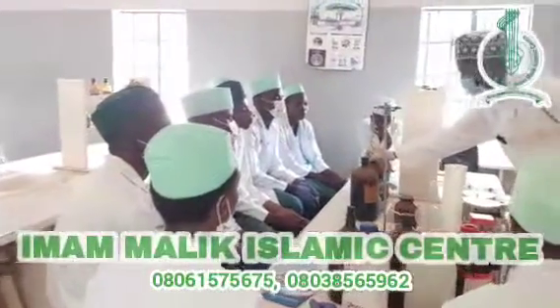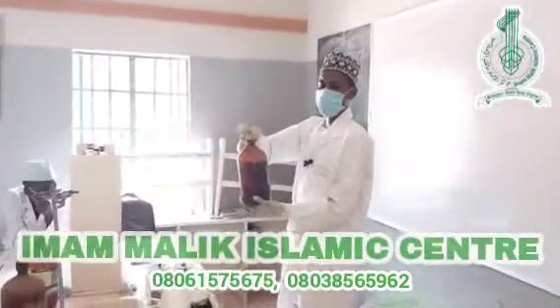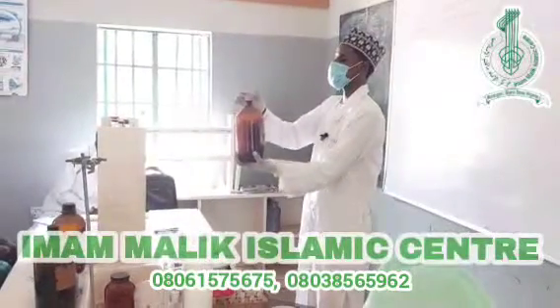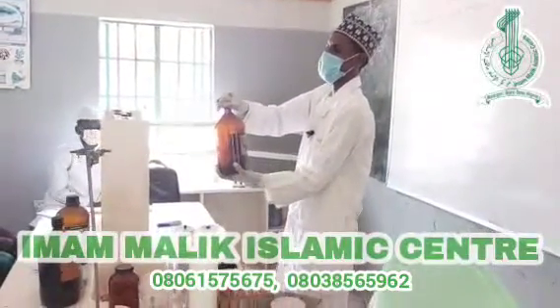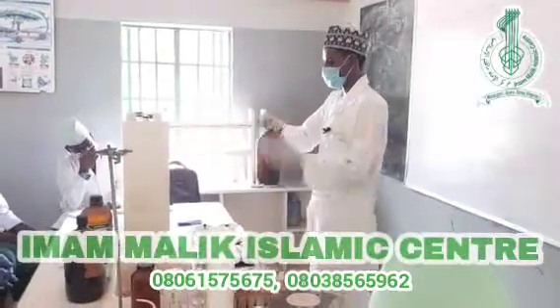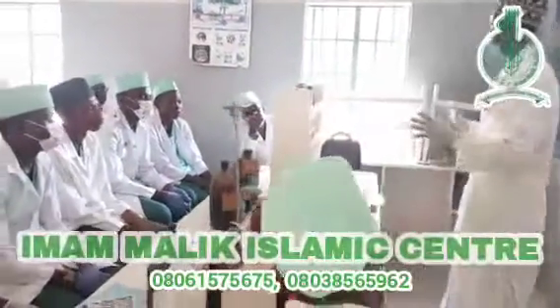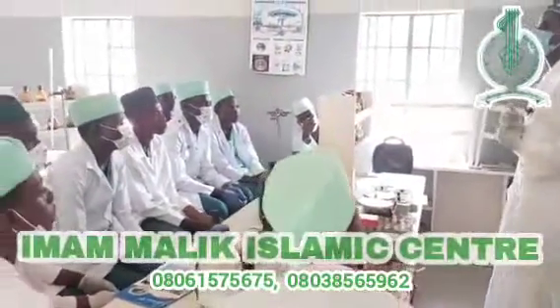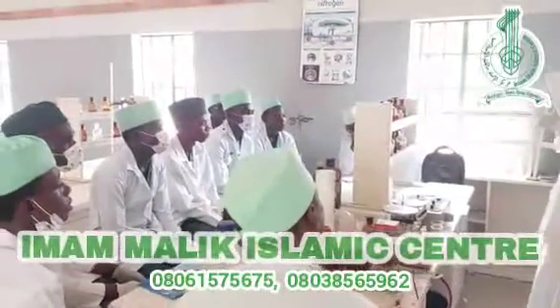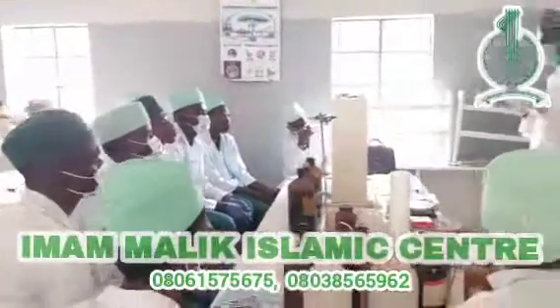For example, this is hydrochloric acid. If you try to open this, at most it should not be opened like this. We have what we call a fume cupboard. A fume cupboard. Because if you open this, fume will come out, and it is toxic to our life. So in most modern laboratories, we have what we call a fume cupboard.